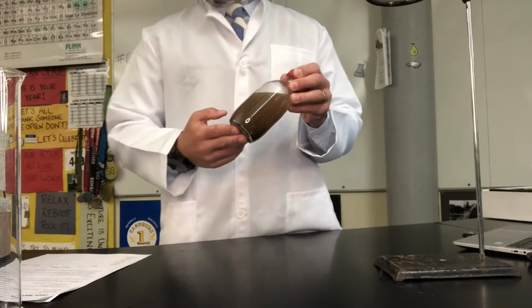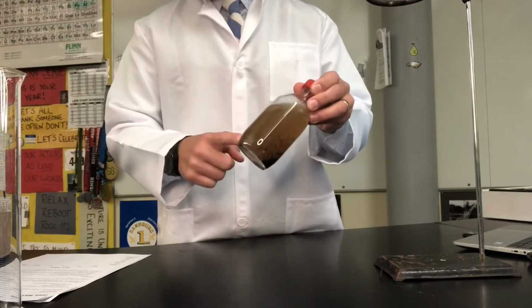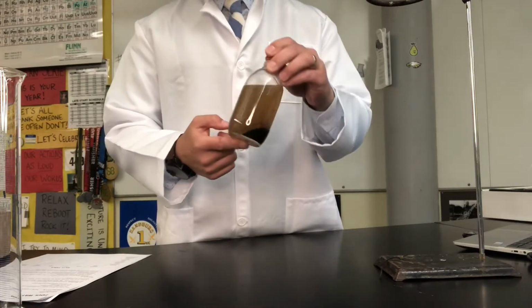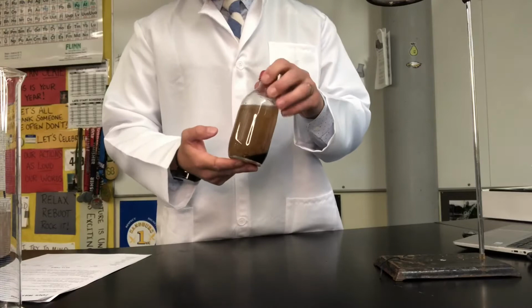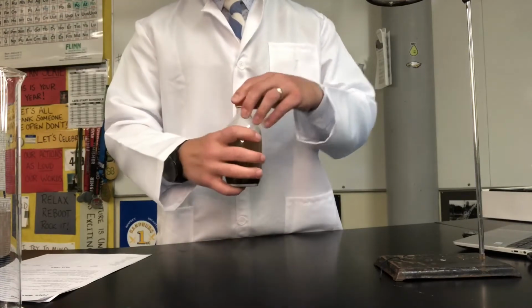If you look at your lab, we're going to be collecting data on its color, its clarity, its odor or its smell, the presence of any oil, if we see any oil in it, and also if there's any solids. So some of these will be a yes/no answer, but we'll go through that.